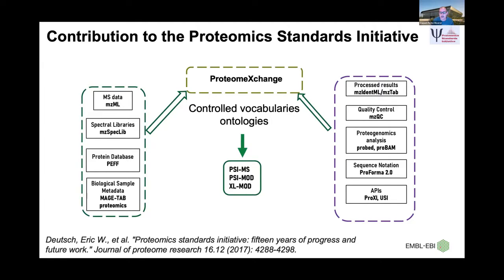For a long time, the problem was that every software produced its own output, and those outputs had versions that were not actually maintained. When you have a database like the ProteomeXchange databases that stores the data for years, you really need a standard that can be kept, that has a well formalized structure, and that people maintain with libraries. And this is what HUPO PSI is all about.